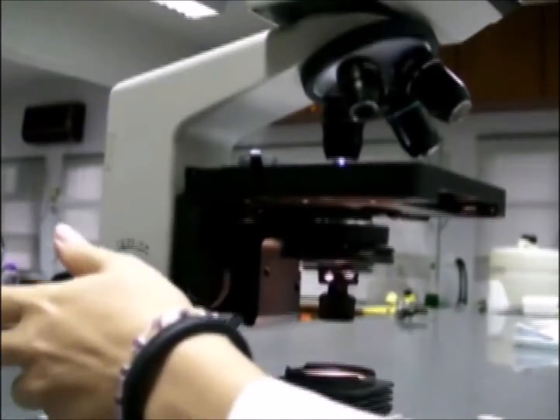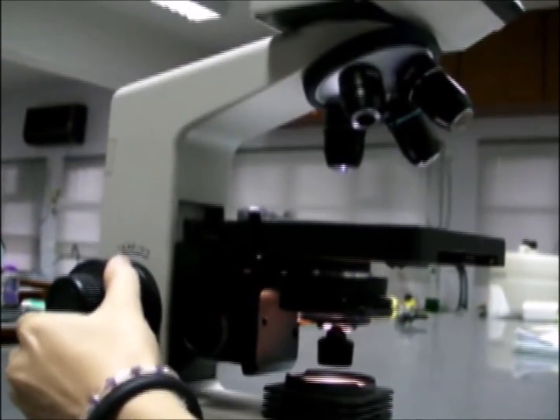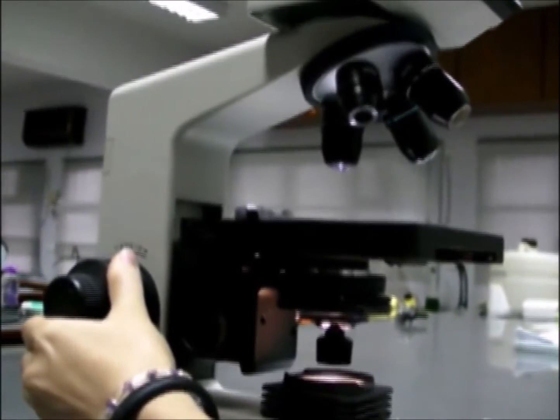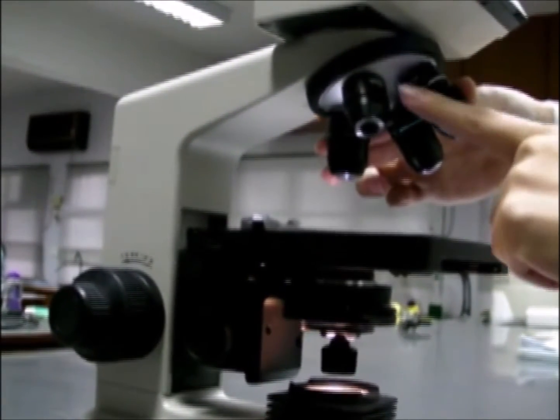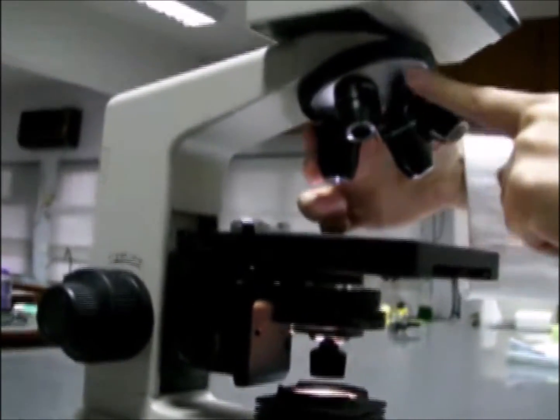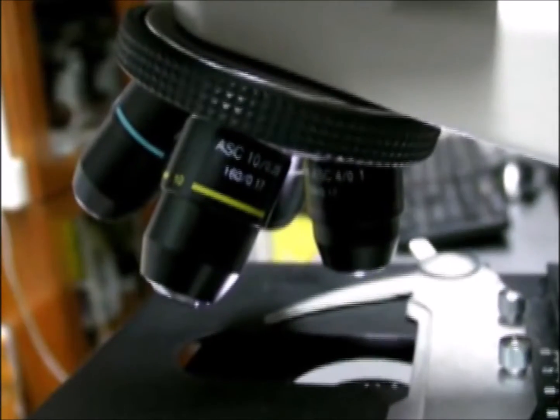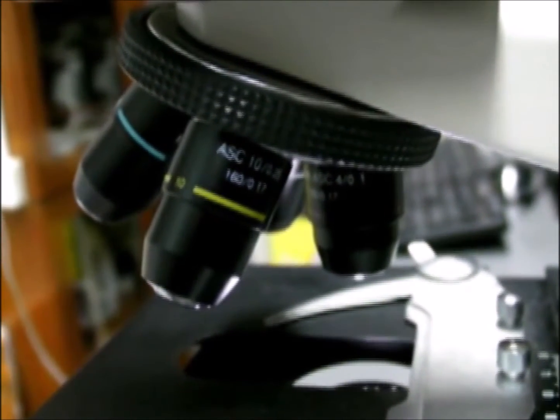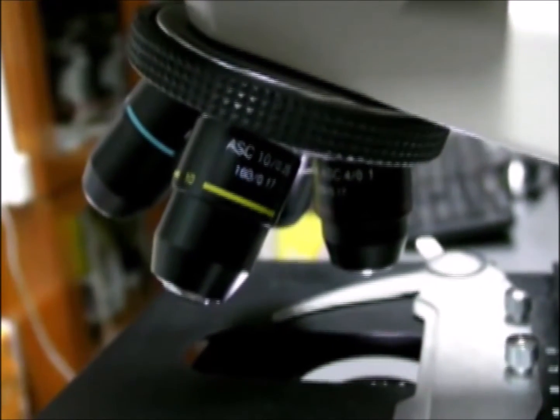So, how do we use the microscope? Turn the coarse focusing knob to bring the microscope stage down, so that there is more space to put in the glass slide comfortably. Bring the shortest objective lens to the center. We always focus the object from the smallest magnification and progressively change to the next higher magnification until we reach the magnification that we want. Never skip any magnification in between.